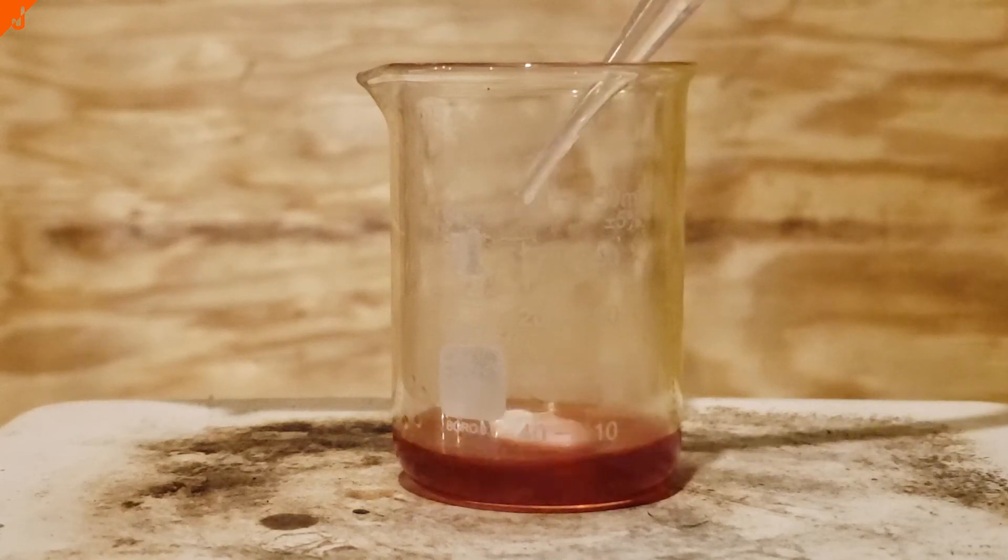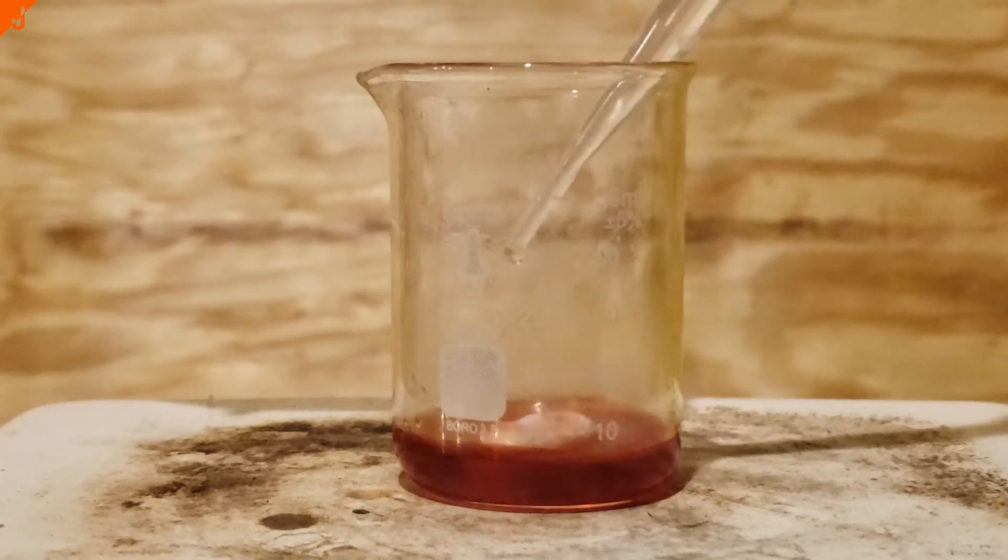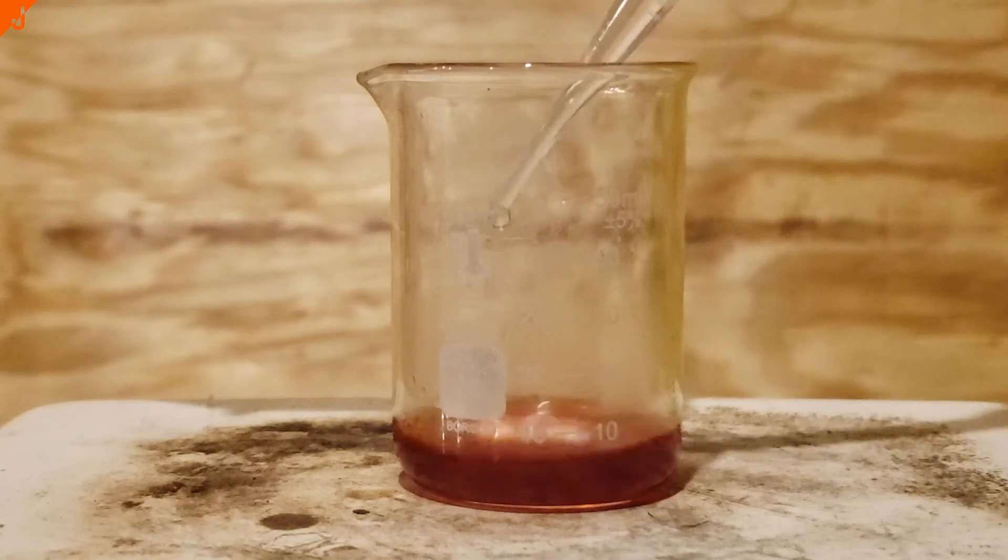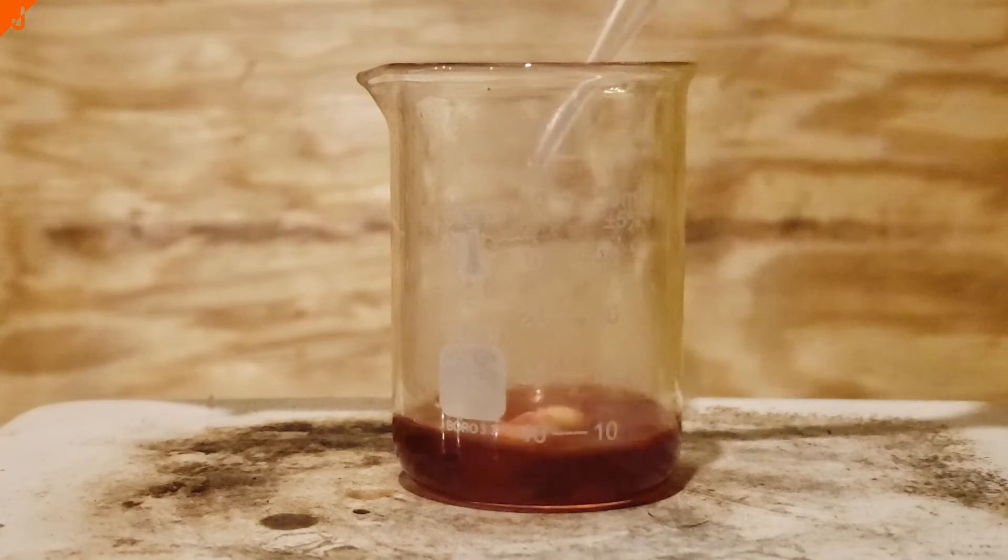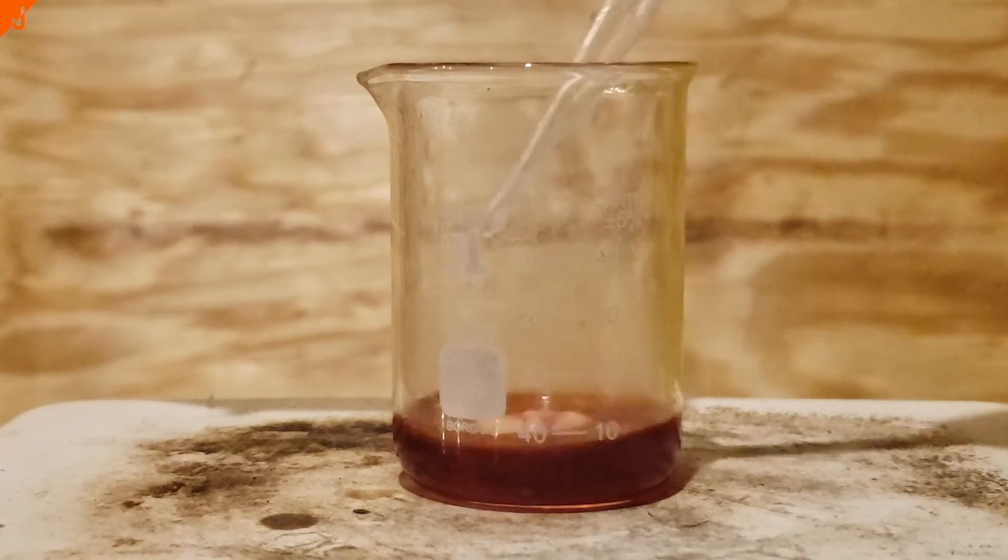Hello and welcome to today's video. Today I'll be making the very strongly colored organoboron compound rosocyanin. This compound is actually really easy to make and I'm surprised there's not more information about it out there.